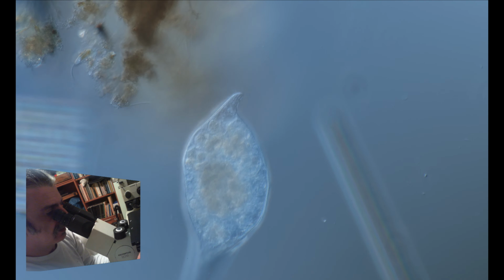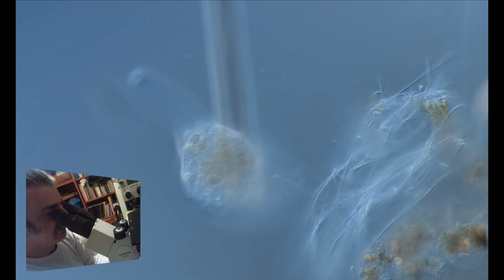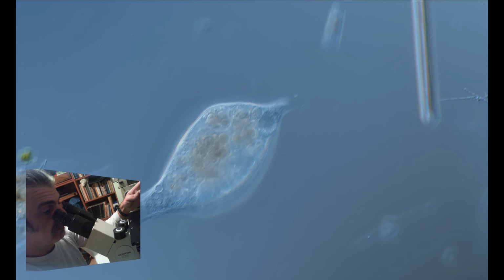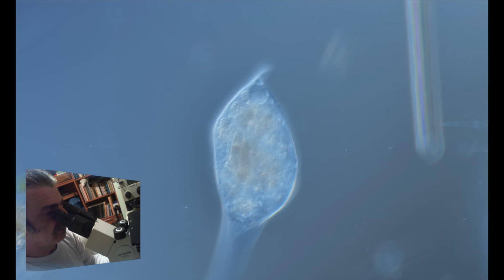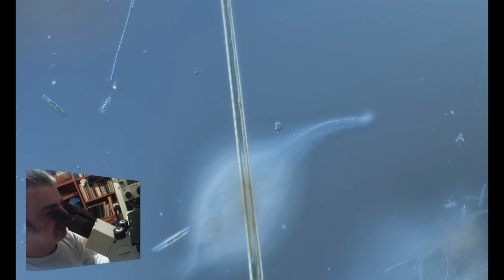And around it we can see a Trachelius, again a very large, magnificent predatory ciliate, which is now very high in the water column, so it's a problem to get a good view of it. Yeah, now it's fine. And here is another diatom, a lonely one.